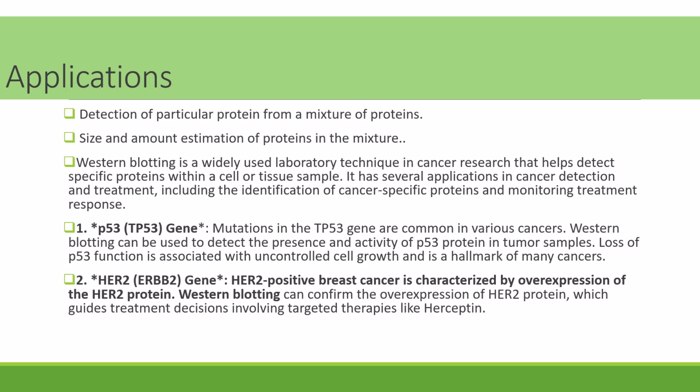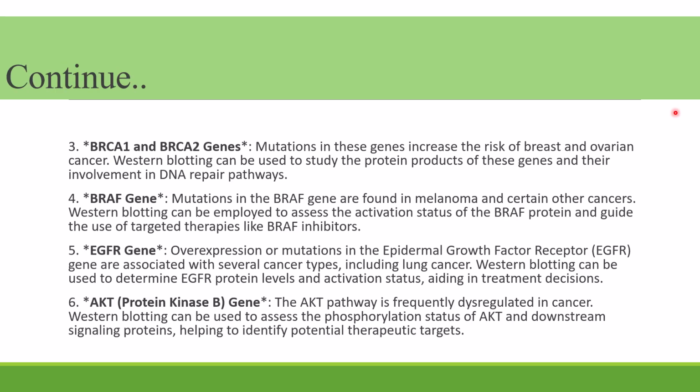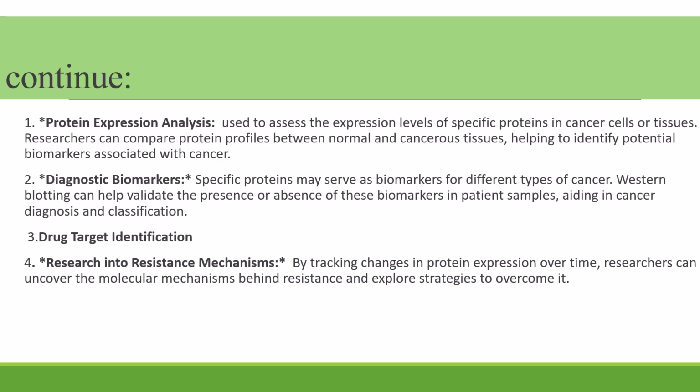Okay. So here are just certain applications. What could be the applications? Major applications are to detect protein expression, diagnostic biomarkers, to confirm what the protein levels are. Suppose somebody is suffering from any disease.